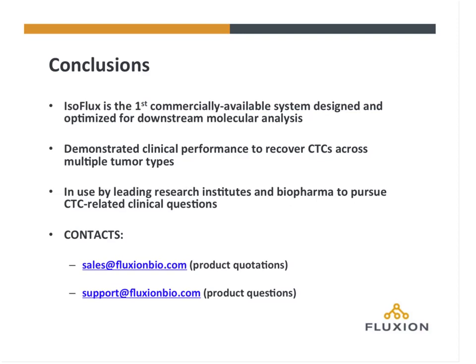Okay, there's a question here: are the cells viable after purification, and do you think that they could be used to look at cellular responses? So yes, we have done tests to confirm that the cells are viable after collection. We can do this through staining methods, and we've done some work in vitro to culture the cells after collection. So the instrument itself has a very gentle processing on the cells.